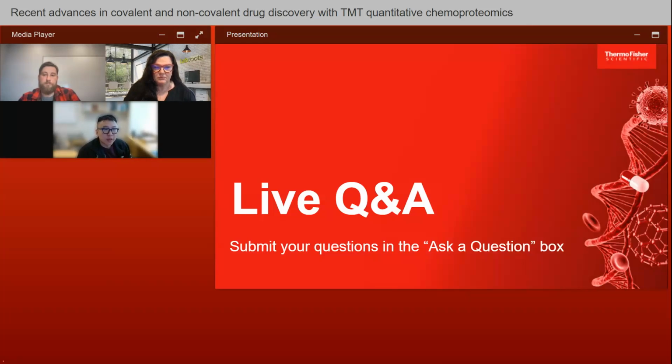Versus if you want to measure the increase in the compound-bound form, you have to figure out the delta mass for every single molecule screened, right? There might be weird things happening on the mass spec or during sample prep that add other modifications to your compound too. So it's going to be a lot of work, but it's doable. And yeah, using DBIA makes things easier to screen hundreds of small molecules.